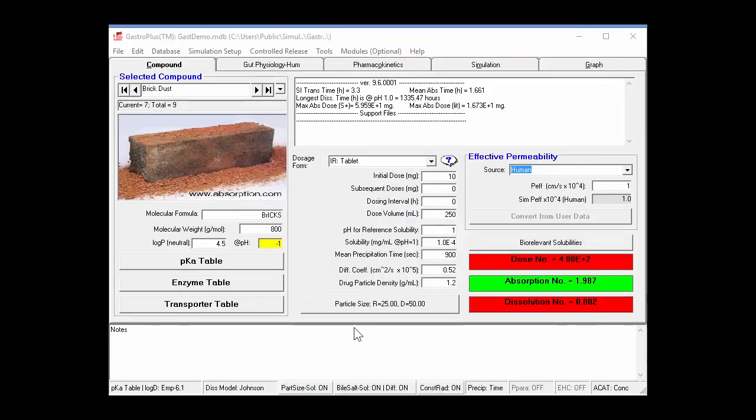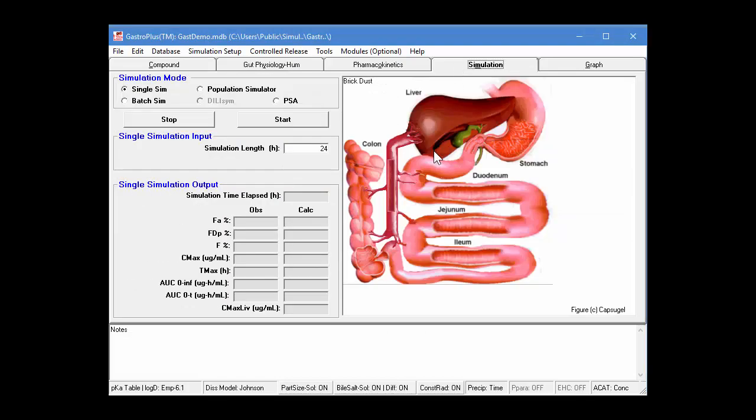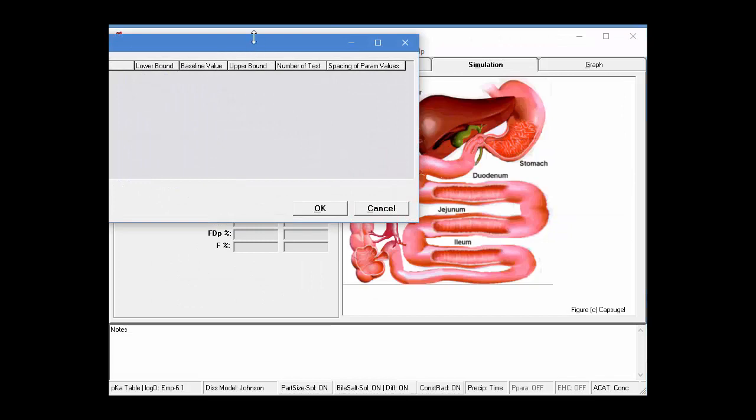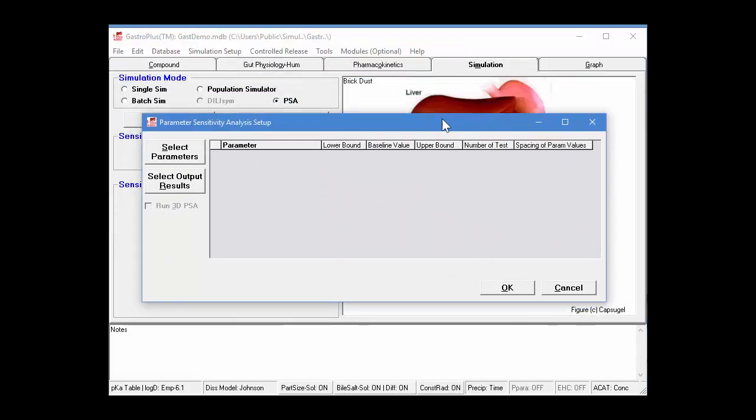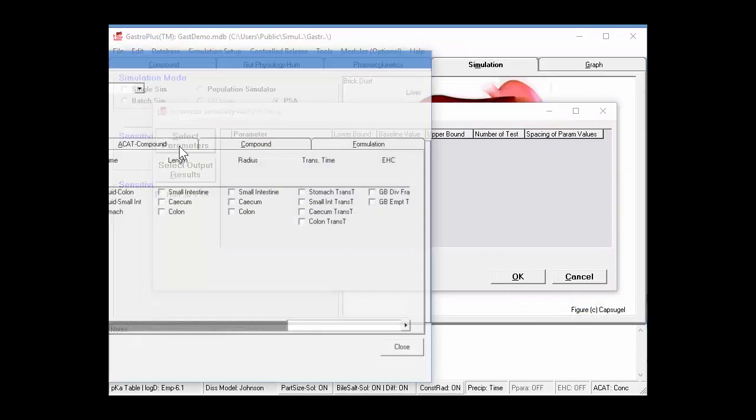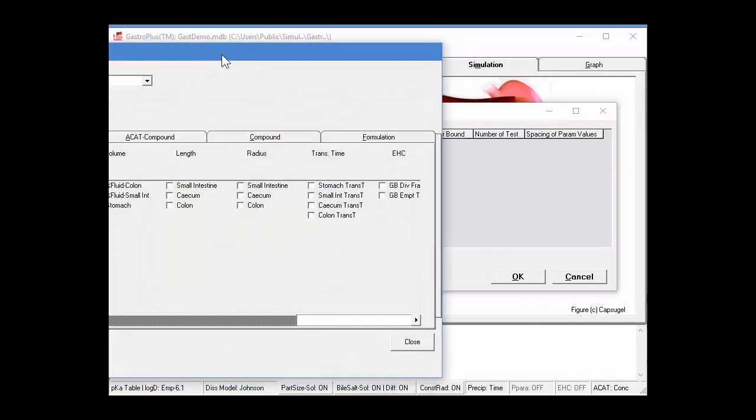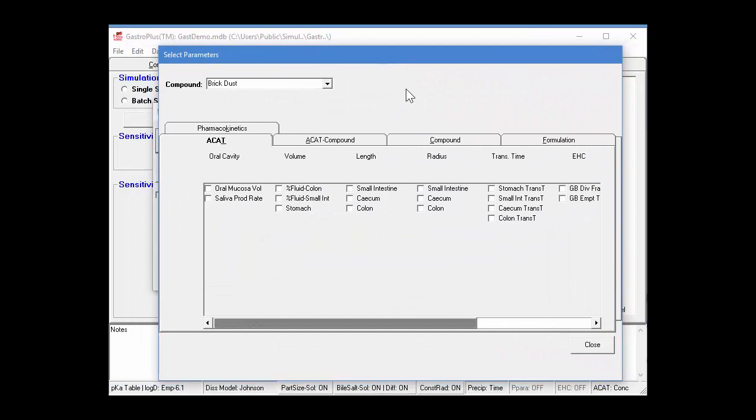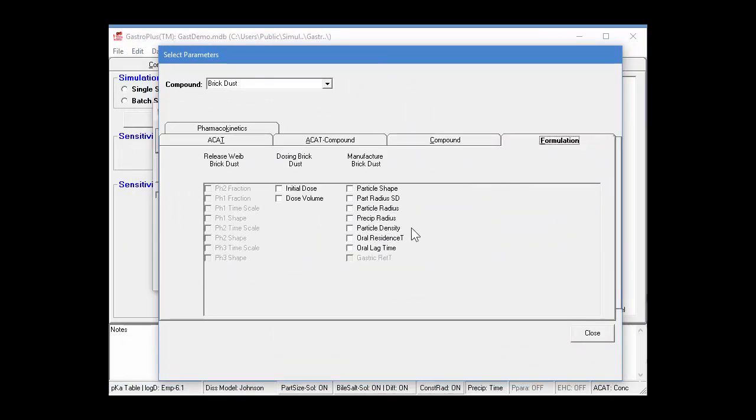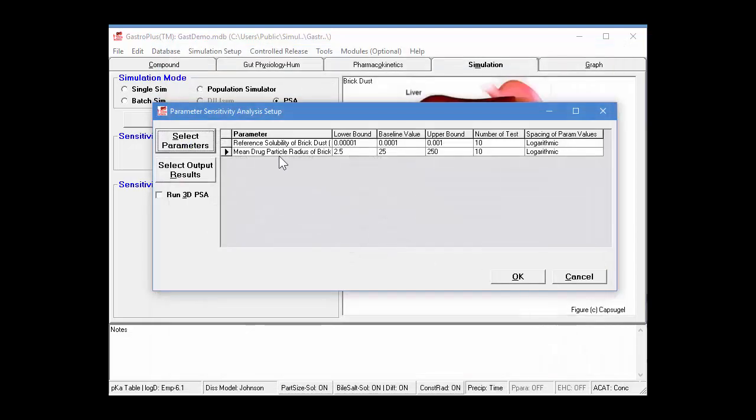So, we've determined that the fraction absorbed is limited by solubility and dissolution. So, now let's try and look at both those parameters being varied at the same time. So, again, I'll go into the simulation tab, click on the PSA, and then select two parameters. So, I'm going to select from the compound tab the reference solubility, and from the formulation tab the particle radius. And then click OK.